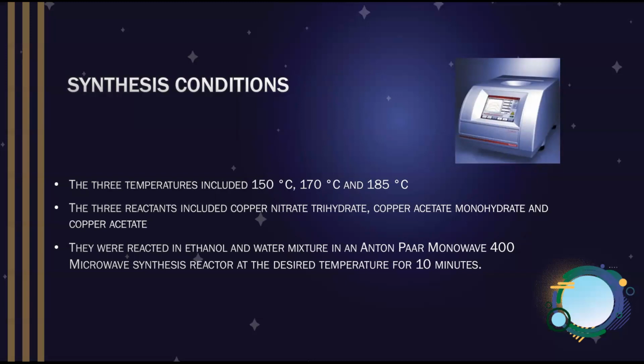For our synthesis conditions, there were 3 temperatures, including 150, 170, and 185 degrees Celsius, as well as 3 different reactants: copper nitrate trihydrate, copper acetate monohydrate, and copper acetate. They were reacted in an ethanol and water mixture in an Anton Paar Monowave 400 microwave synthesis reactor at their desired temperatures for 10 minutes. This is a significant reduction in time and temperature compared to the traditional synthesis method.